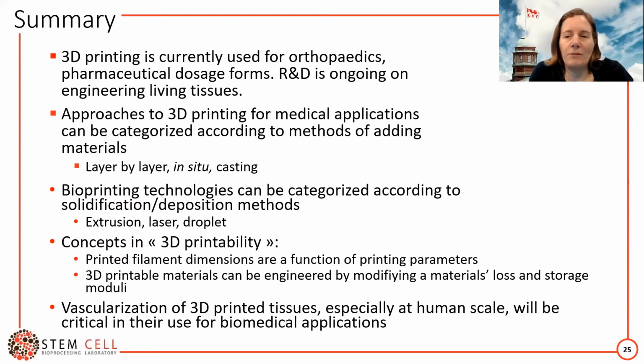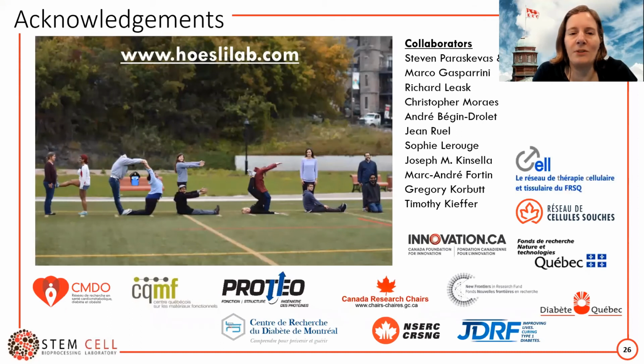And then finally, we showed you some applications by which you can generate vascularized tissues, either by the casting of sacrificial materials, or the second case where Brenden presented some ideas on embedded writing to be able to print and to use materials that are harder to print by more conventional means, so using in situ type applications.